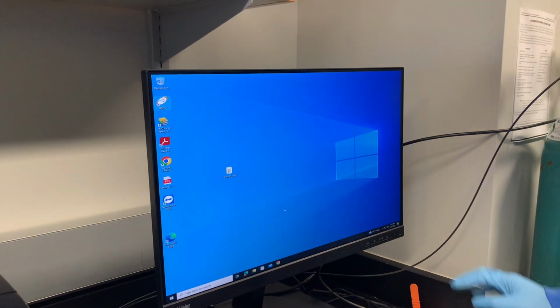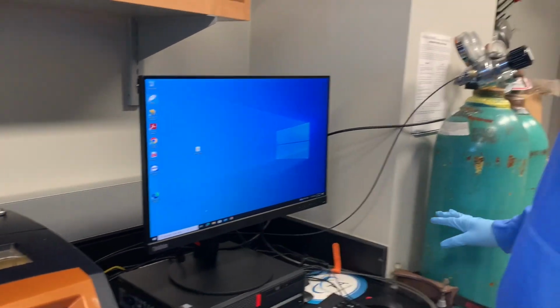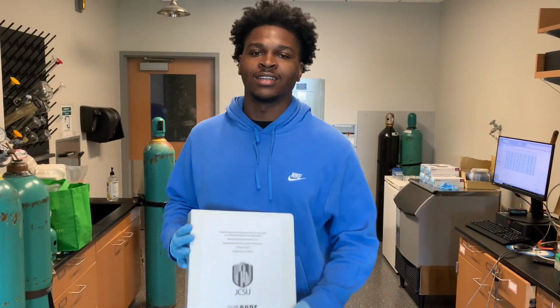Okay, now you can sign out or leave it like this, and the TGA is now back to where you found it.